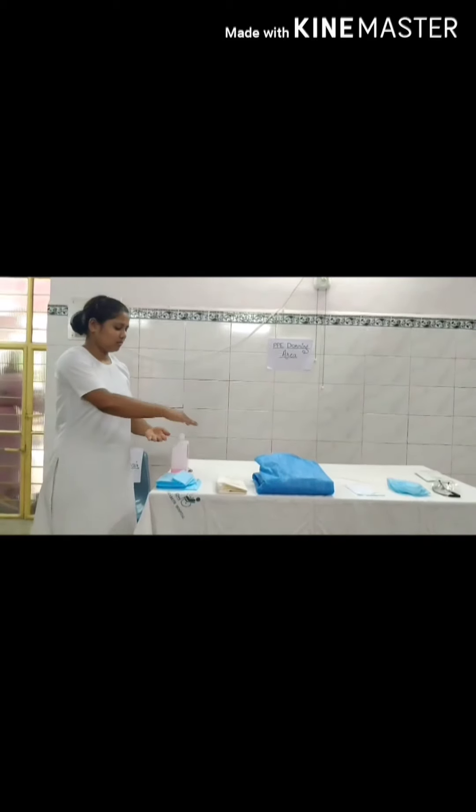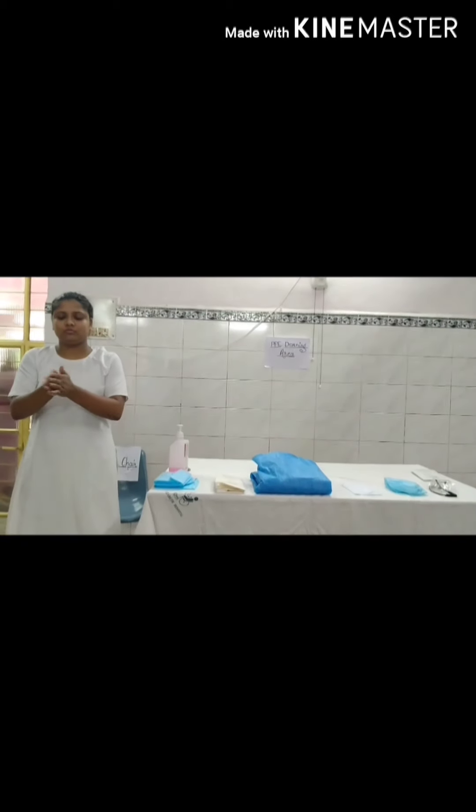Sanitize your hands with 70% alcohol-based sanitizer according to WHO protocol.